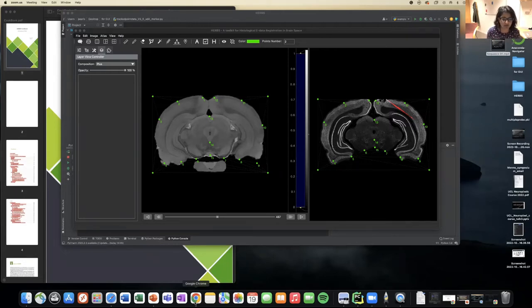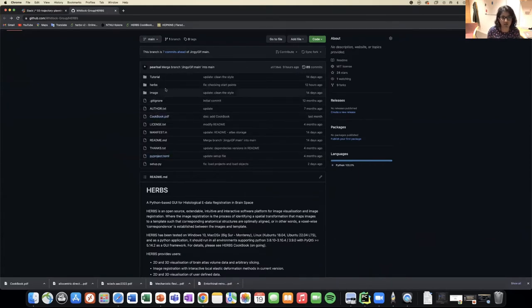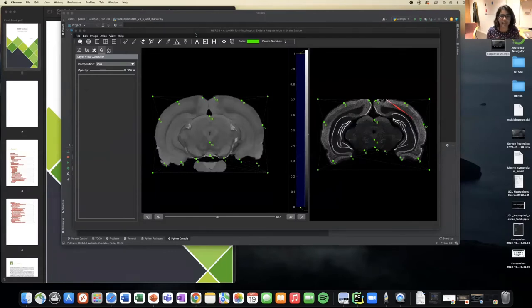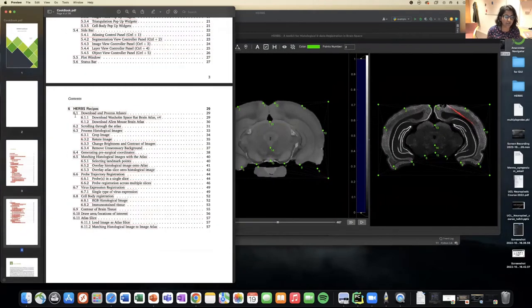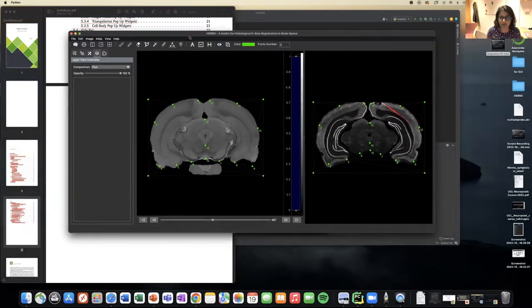You can go ahead and download Herbs on our GitHub page, which is linked on the Slack channel. We have a cookbook—we had a bit of a name play with herbs and cookbook—and we have a couple of recipes here for cooking herbs. In these recipes, it will show you how to download atlases. Currently we only have the rat atlas and the mouse brain atlas. You can go through the cookbook and find illustrations of how to do it. But right now, I will get you back to the GUI.